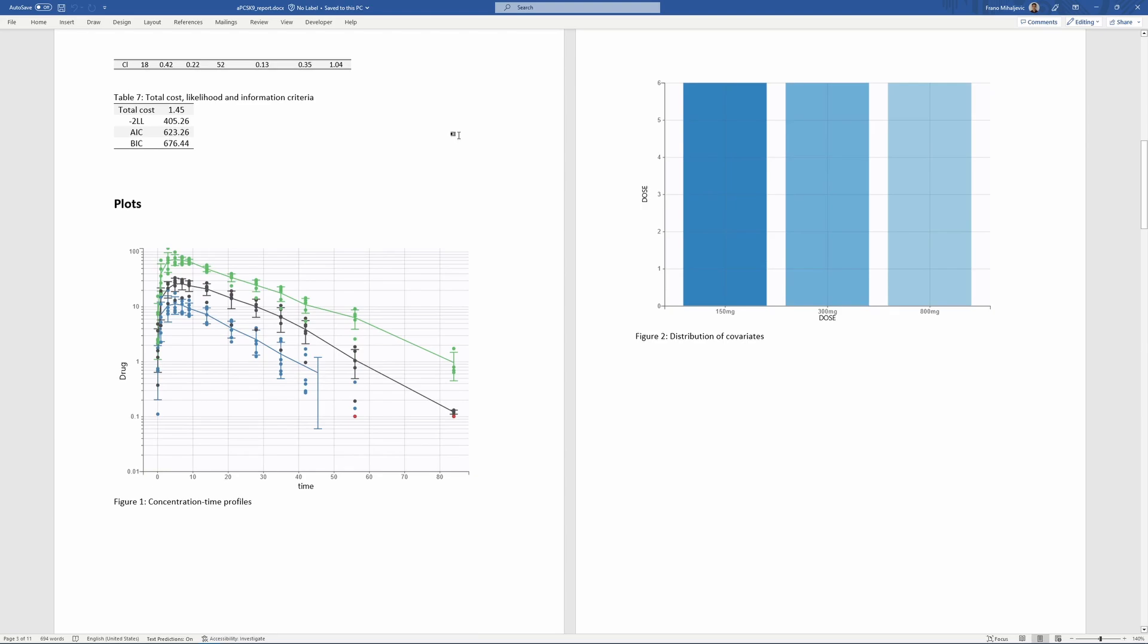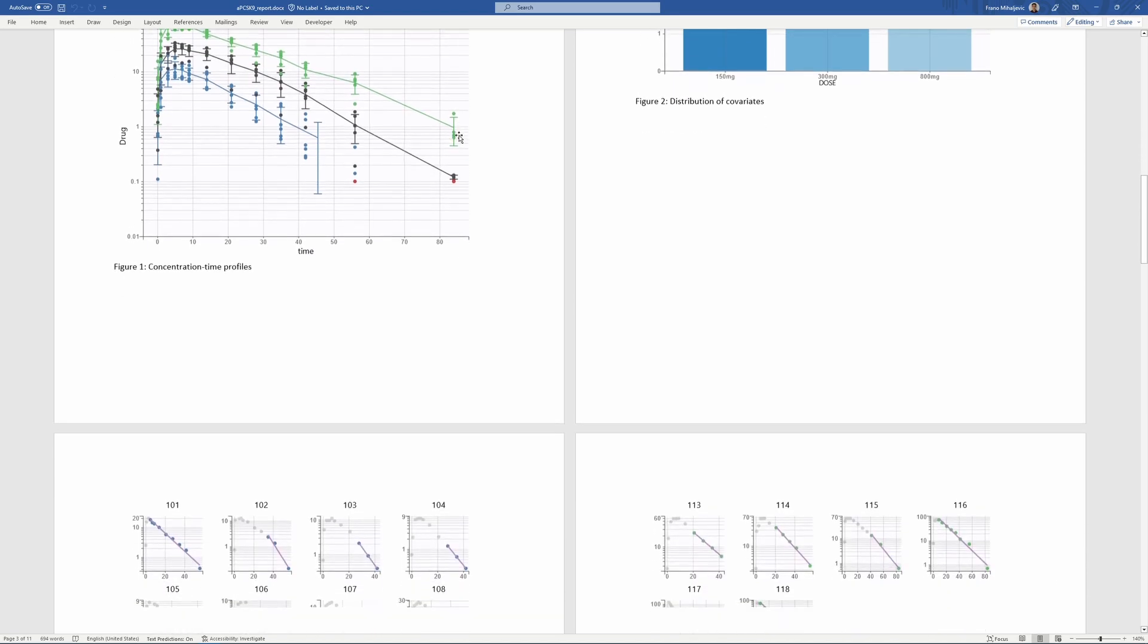For example, in this project I have generated plots for observed data with mean curves for different dose groups, covariate viewer, and individual fits colored by dose group.